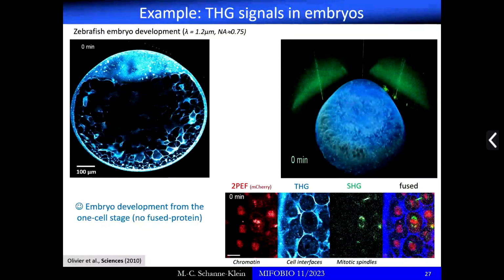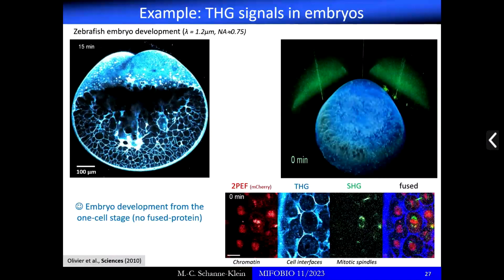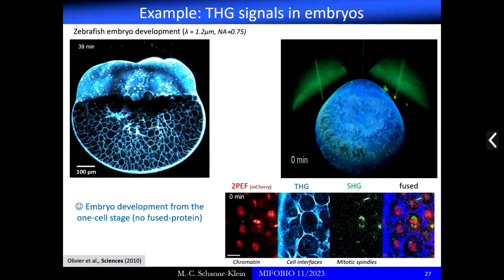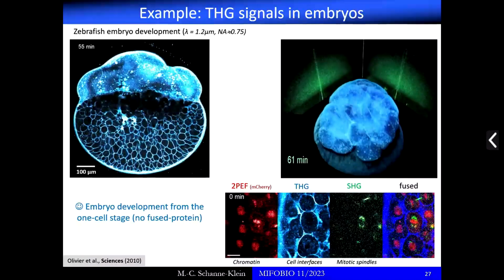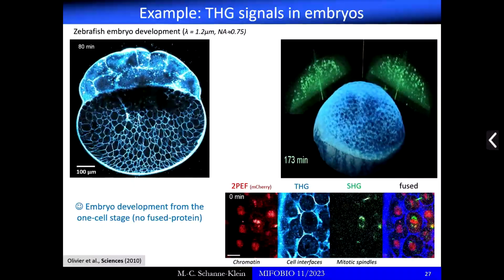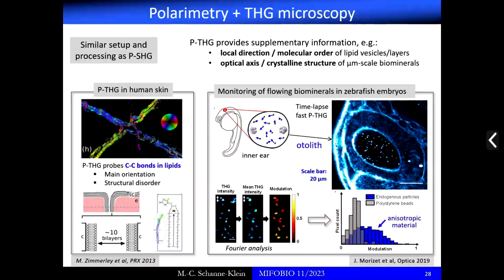Okay, and then I have some, I try to have, yes, it works. It's a very famous movie from Emmanuel and Nicolas Olivier about zebrafish embryo development. So it's really morphological imaging, very efficient to look at this embryonic development. So we can switch to the next one.